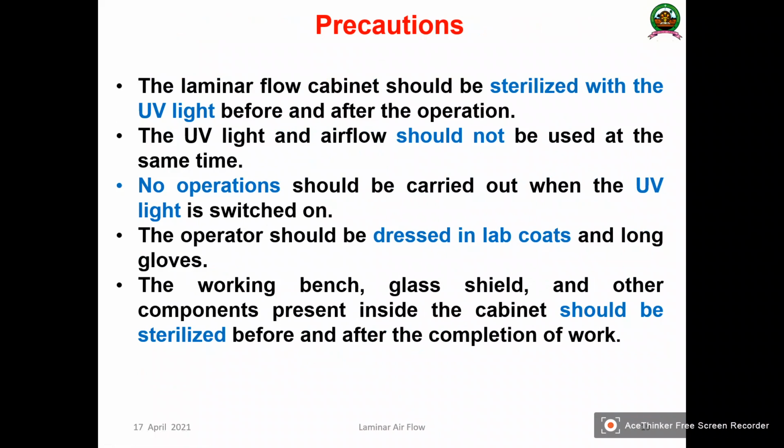While we are working with the laminar airflow, there should be adequate precautions. Most importantly, the laminar airflow cabinet should be sterilized with the UV light before and after the operation. That is very, very important. The UV light is very dangerous and should be treated very carefully, and the UV light and the airflow should not be used at the same time.